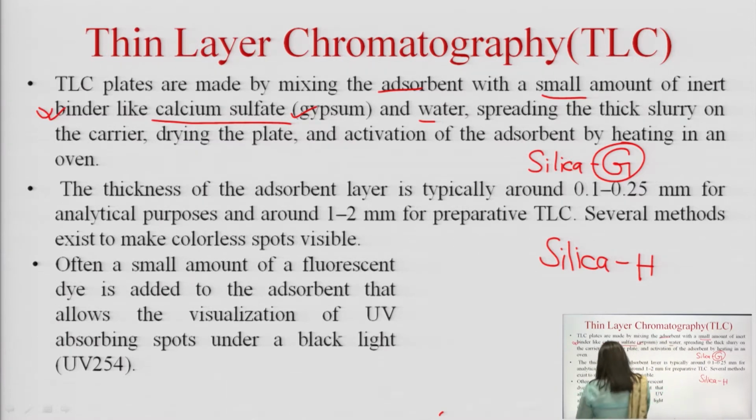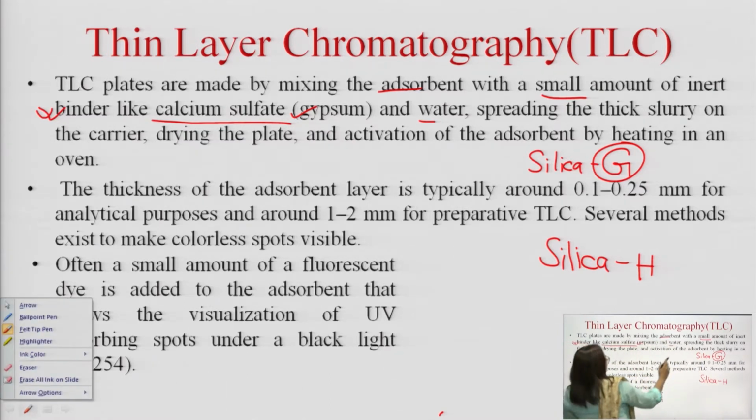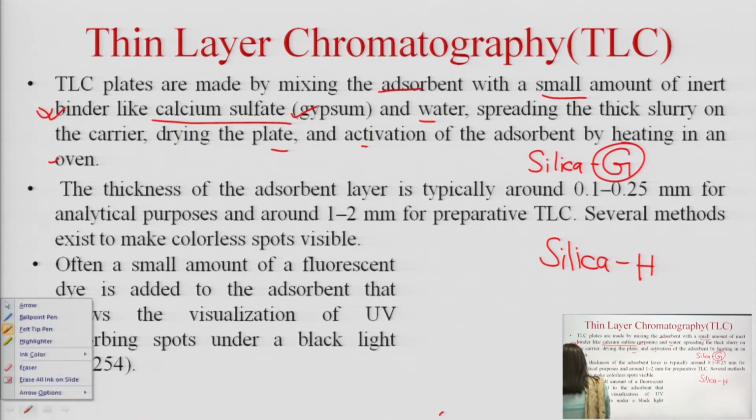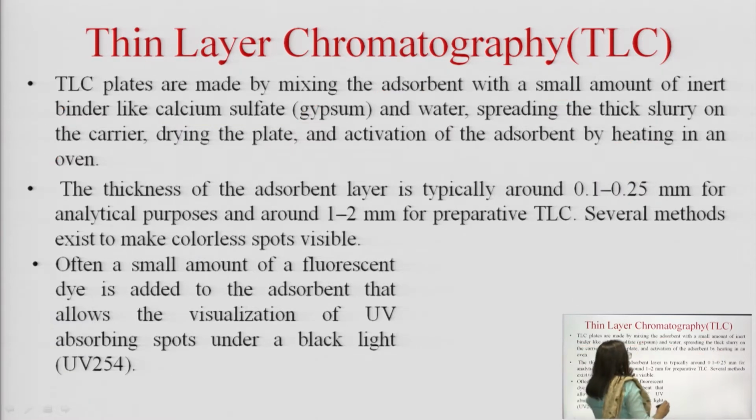Okay, next, spreading this thick slurry on the carrier, and drying the plate. Activation of the adsorbent is done by heating in the oven. So, the activation stage is also very important in TLC. Why?